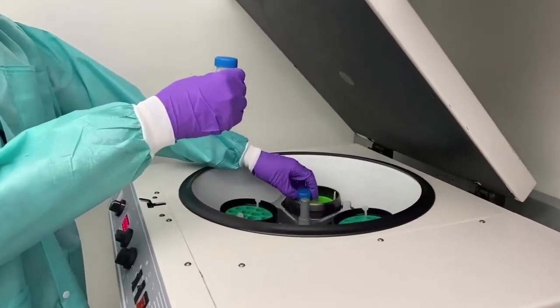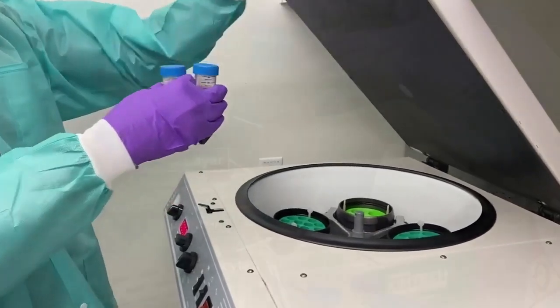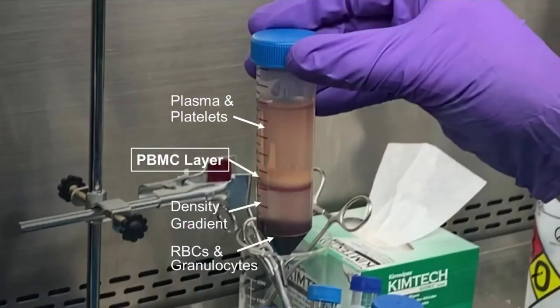After centrifugation, you'll observe four distinct layers. The top layer contains plasma and platelets, followed by the PBMC layer, density gradient media, and red blood cells and granulocytes on the bottom.